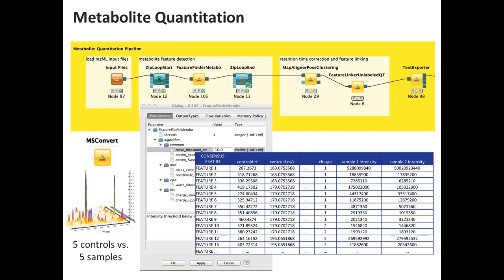So can you just apply this metabolome peak finder to your proteomics data? You can, and we've done it. It will not recognize these peptides as metabolites.